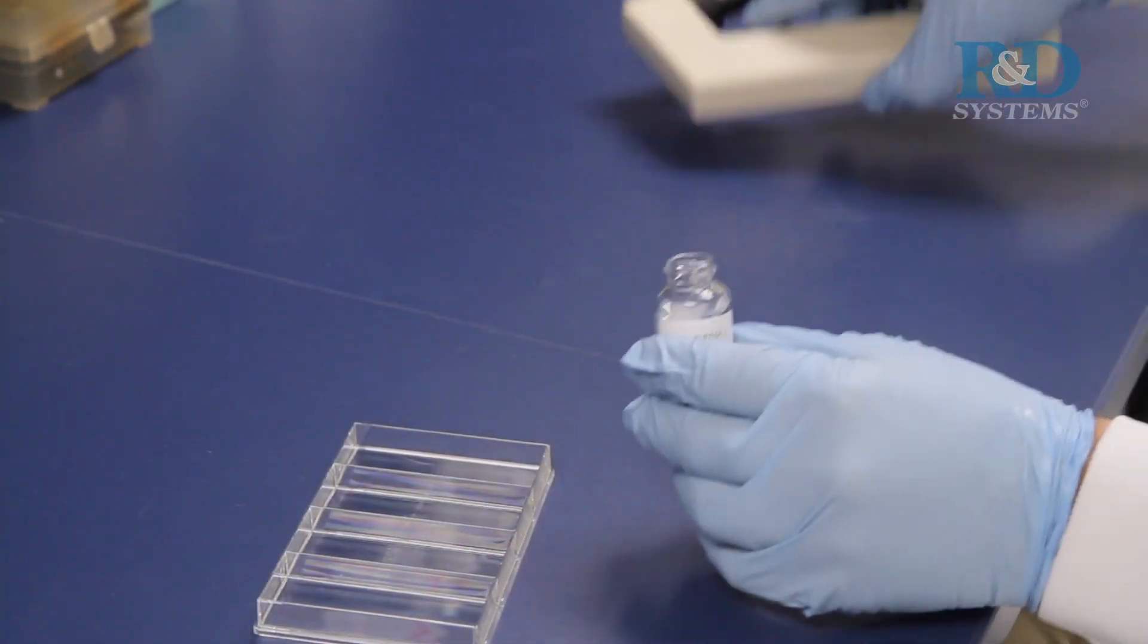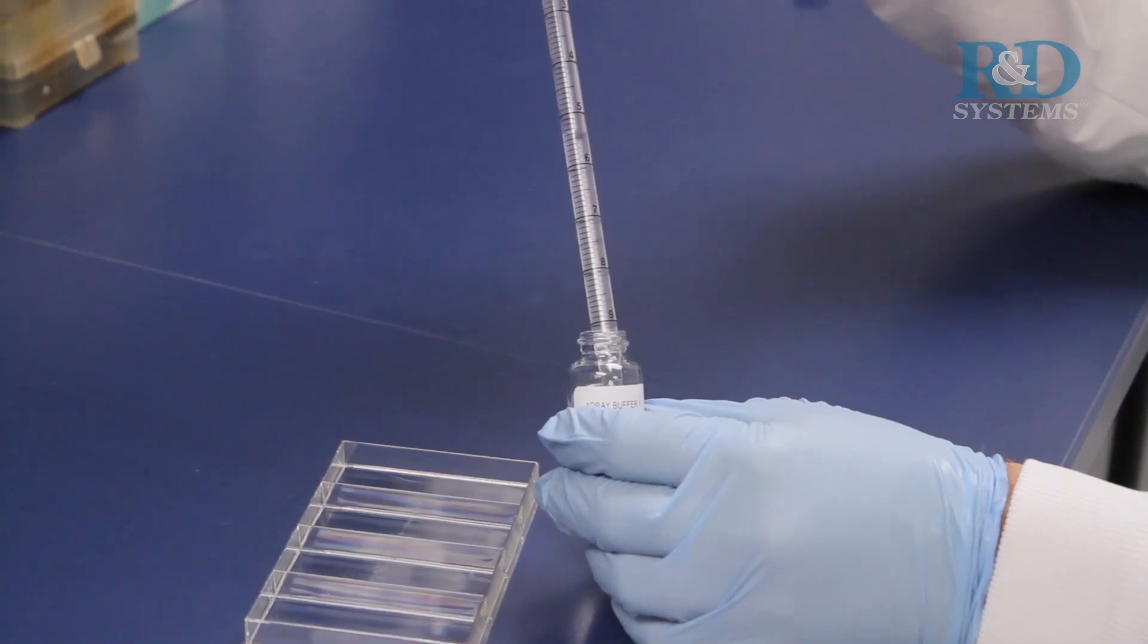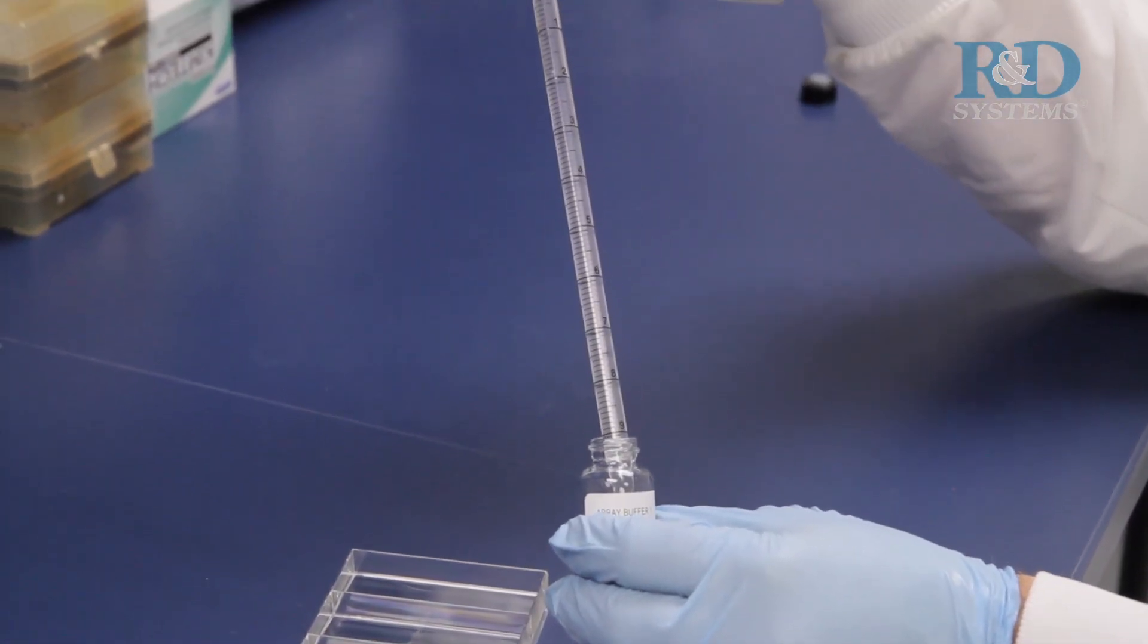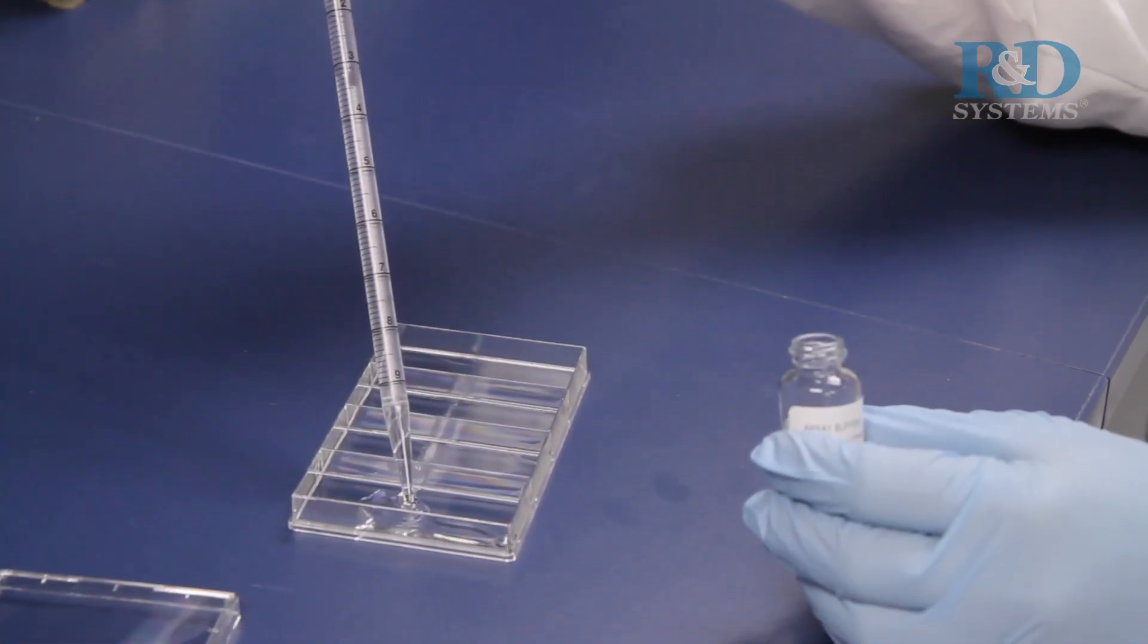Once reagents are at room temperature, pipette 2.0 milliliters of array buffer 1 into each well of the 4-well multi-dish to be used. Array buffer 1 serves as a block buffer.